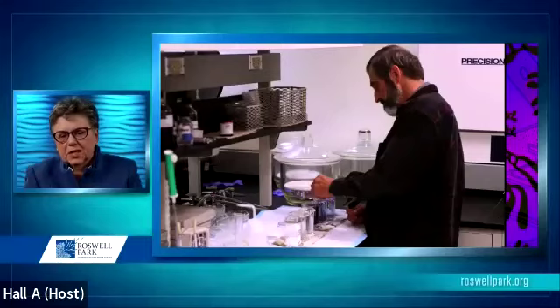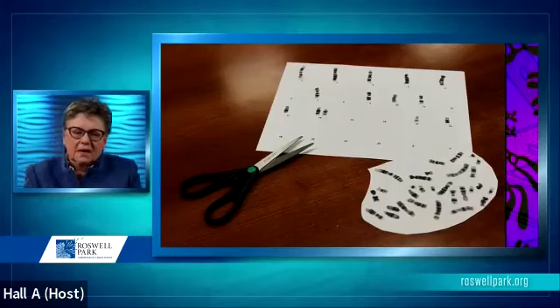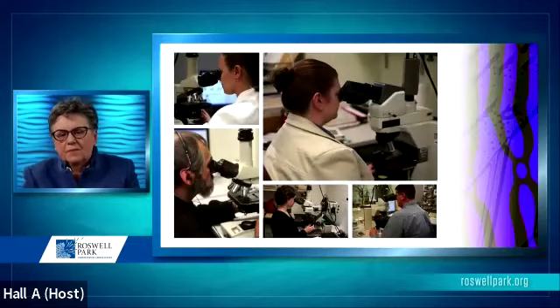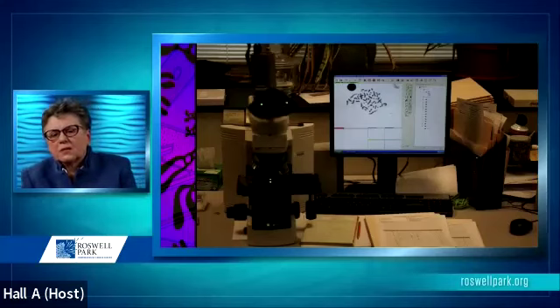We can manually stain slides, and prior to 1990, you probably would have photographed your chromosomes through the microscope and cut them out. We do this exercise with students now, but we now have the opportunity to use a camera that's on top of a microscope. We started out with a CCD camera that captured the image and used software that allowed us to create a karyotype by just clicking and moving the chromosomes around into a karyotype template.